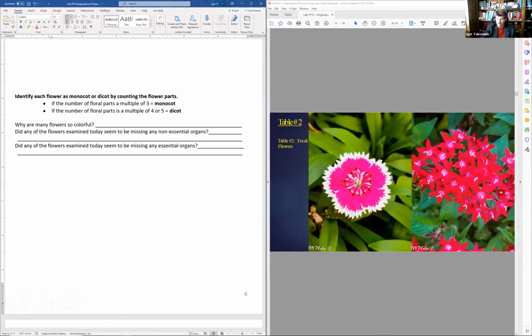You can clearly count 1, 2, 3, 4, 5 petals. So 5 petals right here. Whenever you're looking at this, 1 petal, 2 petals, 3, 4, and 5. I had a student before coming to me in a face-to-face class with that particular flower and saying, well, I'm not really sure if it's a monocot or dicot.